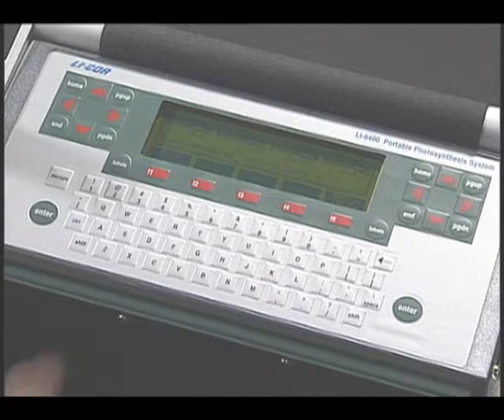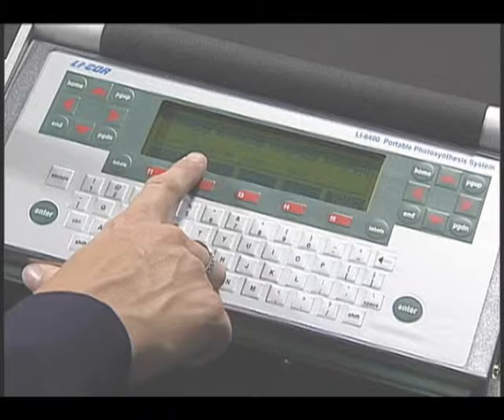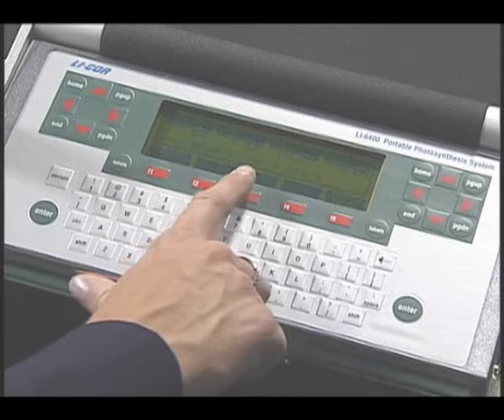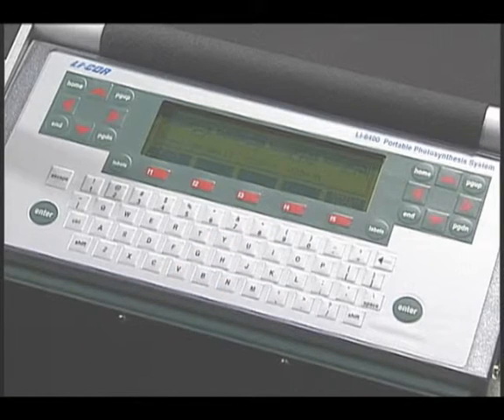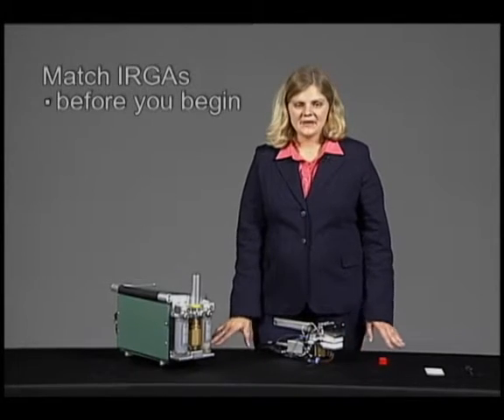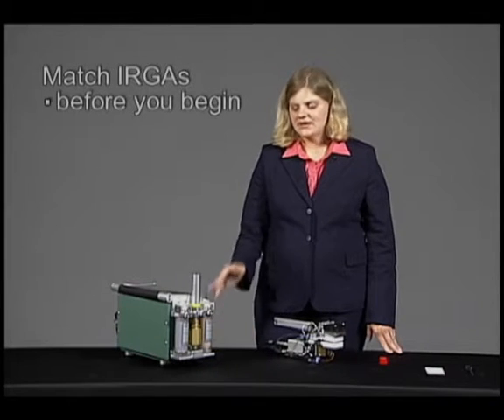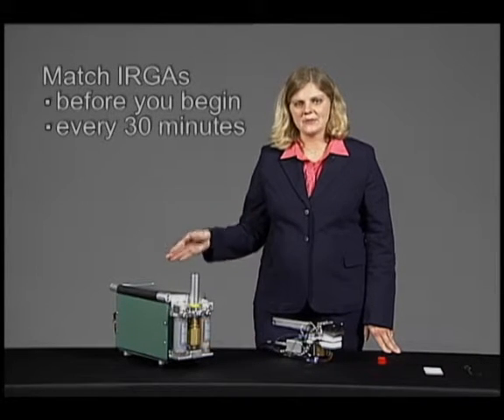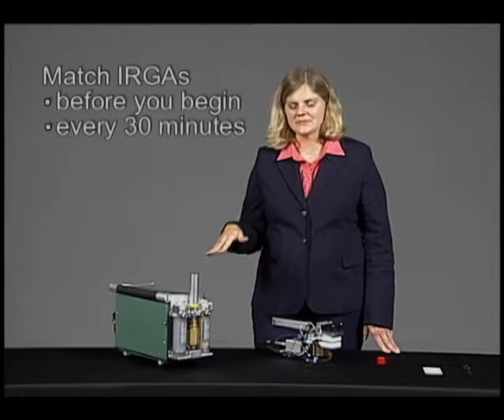When you press match, you'll notice the bottom line has a counter that tells you the time since you previously matched and what the concentrations of CO2 and water were when you last matched. You should match at the beginning of the day before you start taking measurements, and you should match about every 30 minutes throughout the day when you're taking measurements at the same CO2 concentration.